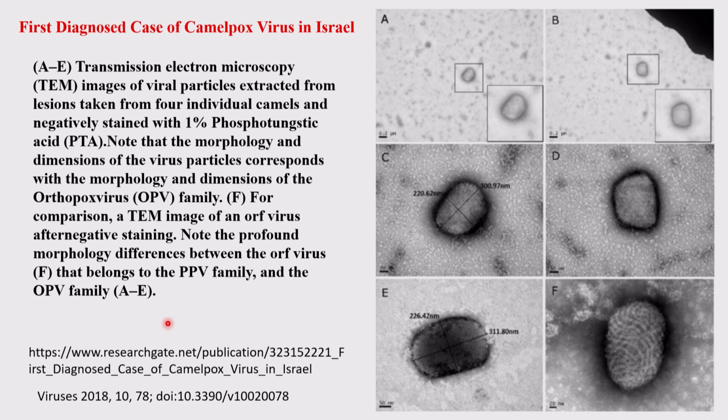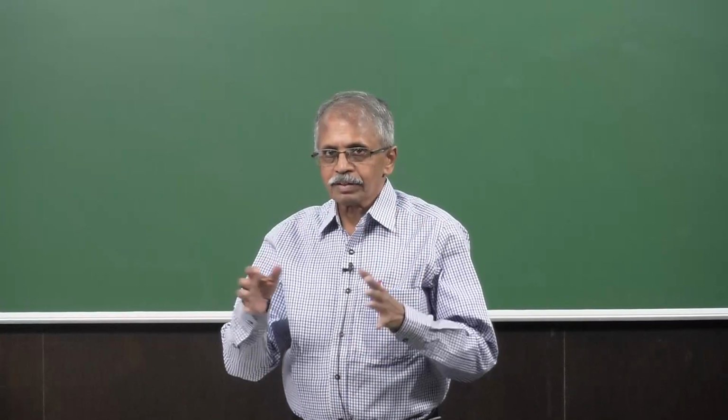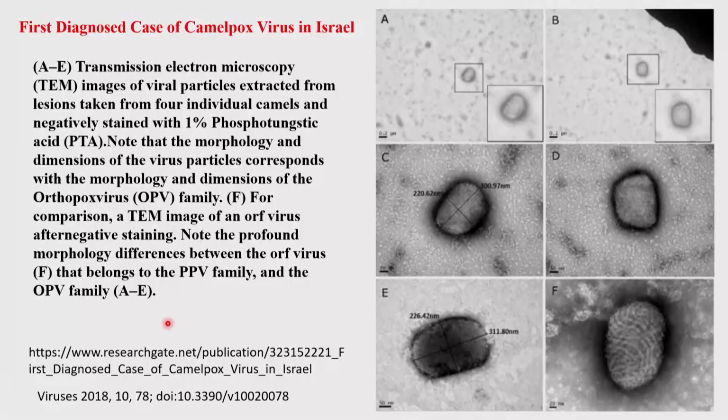An example I showed you in the previous slide, even the coronavirus, where reasonable levels have been identified, the exterior attachments, interior RNA, and things like that. Further pictures are coming up nowadays with greater resolution. If you go into the literature, you will find even better than that.